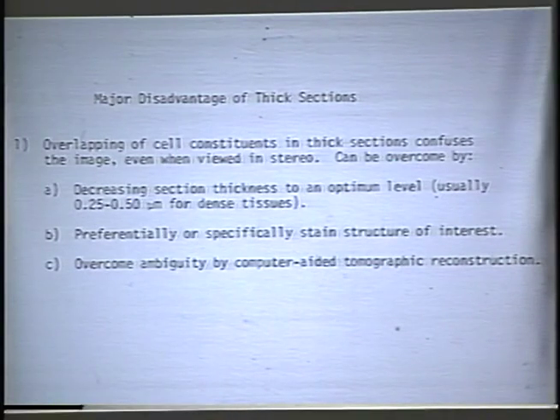And there's a general rule of thumb in selecting the thickness of serial sections, and that is you want the sections to be thin enough so that there won't be that much tracking in X and Y as you go through Z. So if you have a very large, smooth structure, you can use quite thick sections. If you have a very intricate structure in which it's very busy in X and Y as one goes through the Z dimension, then you need thinner sections. Next slide.